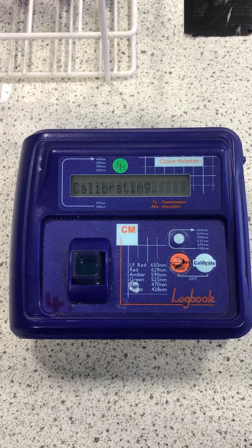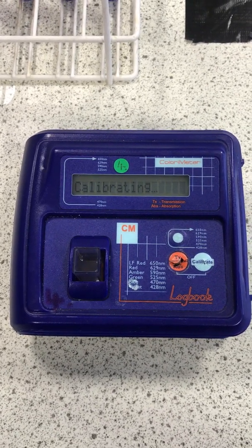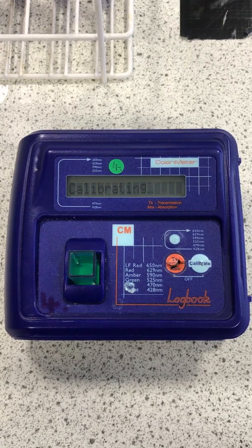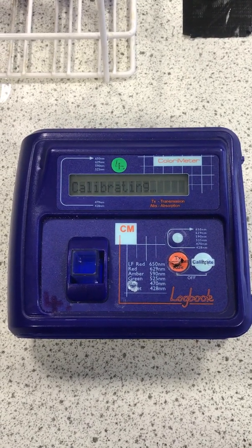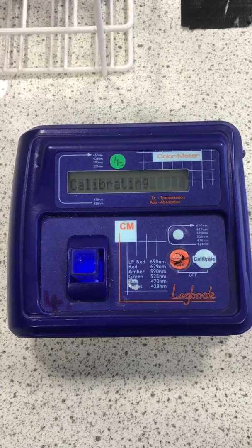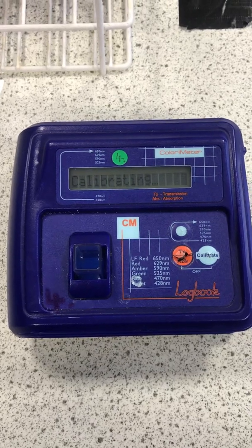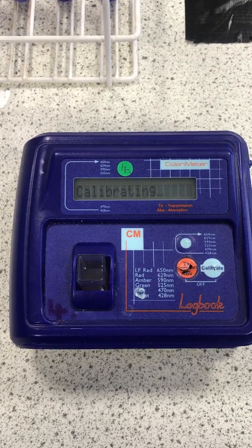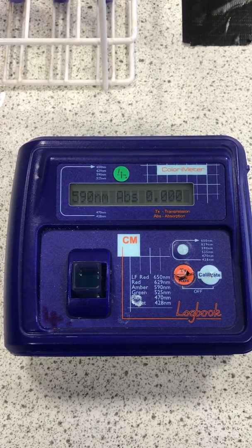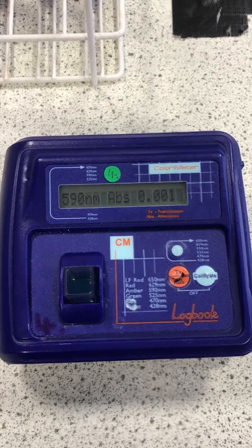Okay, the calibrating is an important step. As we've said, it means that all the others can be compared to this one. So it's good to get the machine thinking that this is 0. This can sometimes take a while, but we can begin to see here the light that we've discussed earlier on. Okay, fantastic. It now thinks that this one is 0. So now we can start reading the other values.